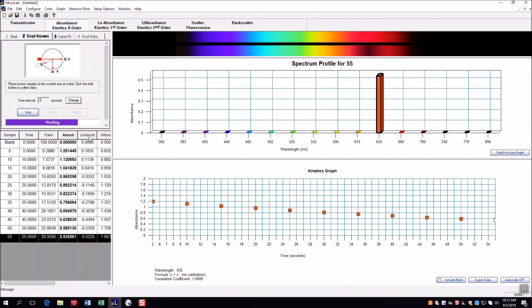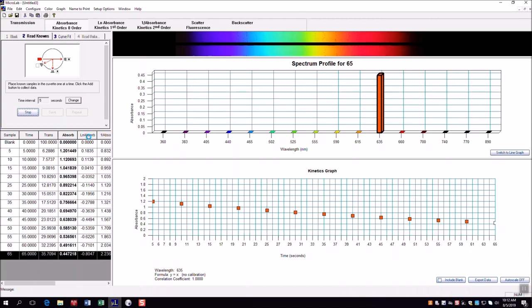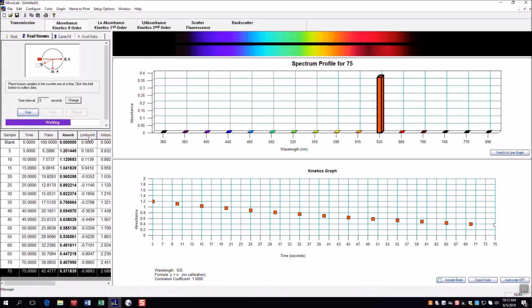and it's important to do a check while this is going on. It is possible that you mess up while making your solution and you add an extra milliliter of sodium hydroxide instead of adding the bleach, which is possible. In fact, when I was looking at my graduated cylinder of bleach before, I wasn't 100% confident that I had put bleach in there and not sodium hydroxide, so I was a little concerned how this was going to go, but luckily we can tell that it's working.